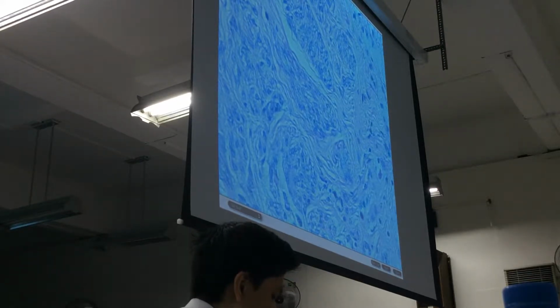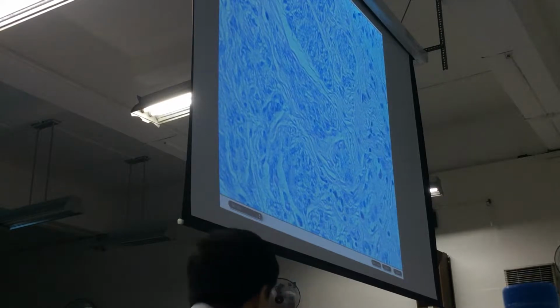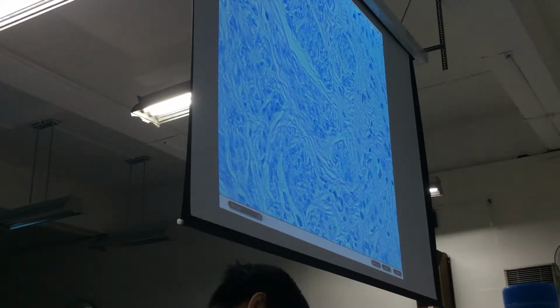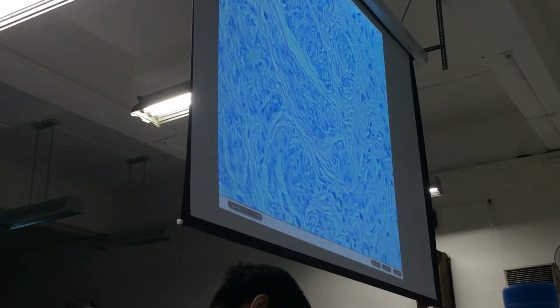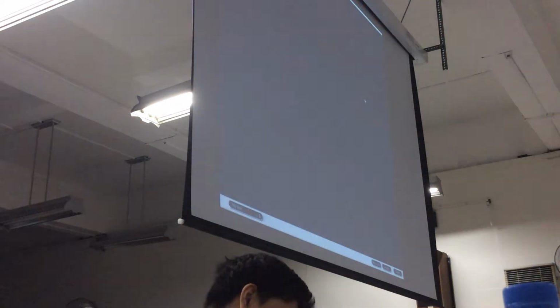So let's go now to slide number M1005. M1005 is a slide of the cervix uterine.